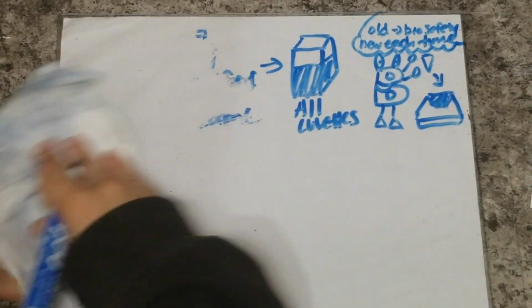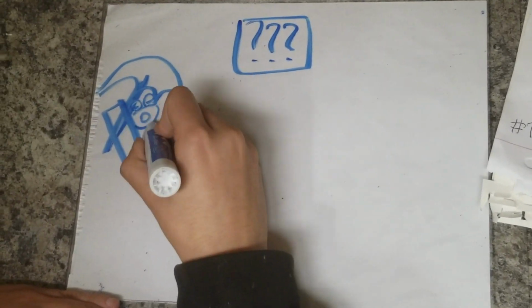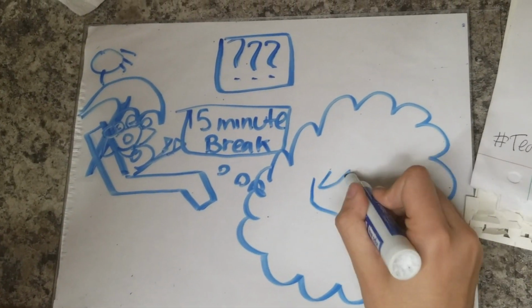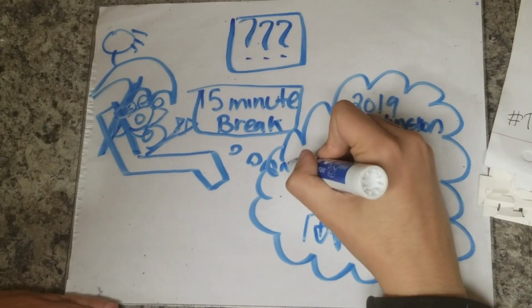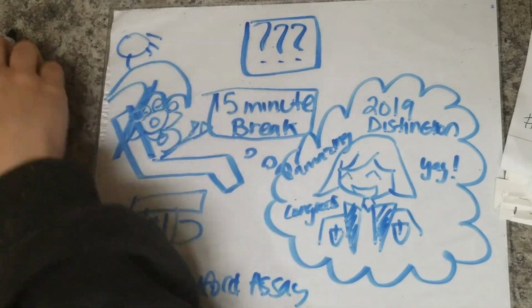Are you with us? Now you can take a break as you incubate your samples for 15 minutes at room temperature. In this time, you can think of how amazing Marion McKinley Bradford is and reflect on how she got the University of Georgia Distinction Award just last year. A great day for the Bradford Assay.